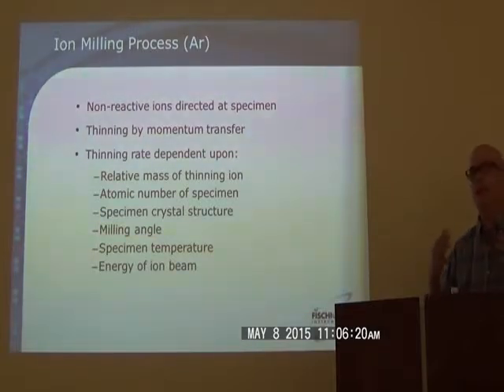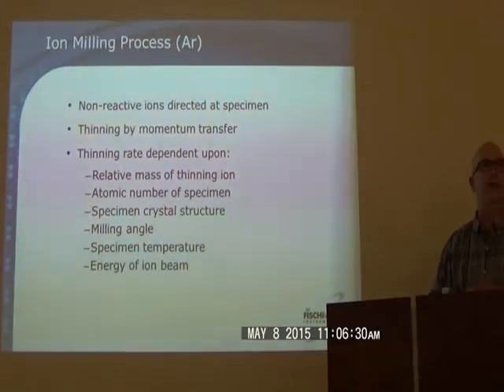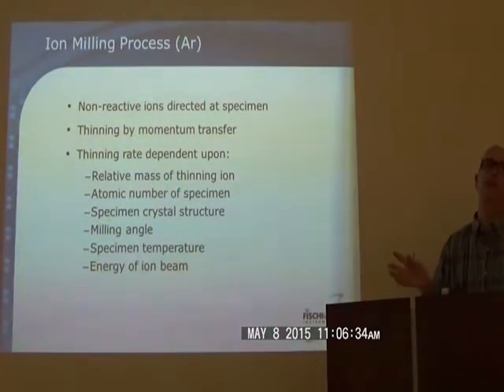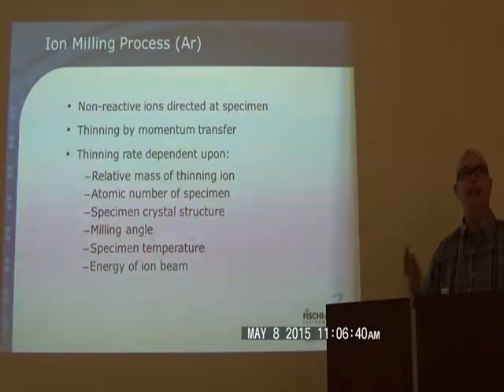And milling in a mechanical sense is just having a table move back and forth with tooling and going layer by layer down through a material with a physical machining process. We're kind of going to do the same thing, but now we're going to do it in a different way. We're going to use the energetic ions. We're going to use the bowling balls to remove material layer by layer and optimize the surface.